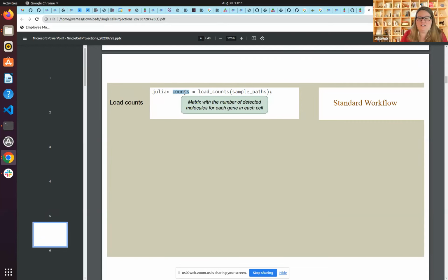Sorry, one more. Go ahead. Is the count expression level? So I'm sorry, excuse me. Let me rephrase that. So the count is expression level, is the question. I don't know what that means. Anyway, so we can follow up async after on that one. Folks, if there is a question we can't answer or can't do, we will have somebody follow up with you afterwards. So don't get frustrated if we can't do it right now.